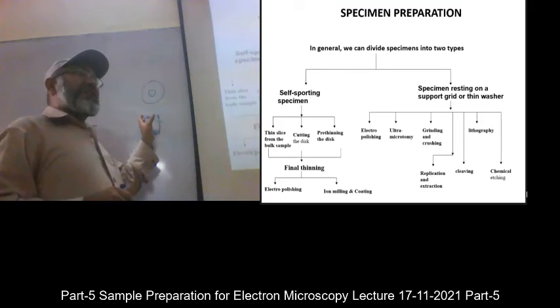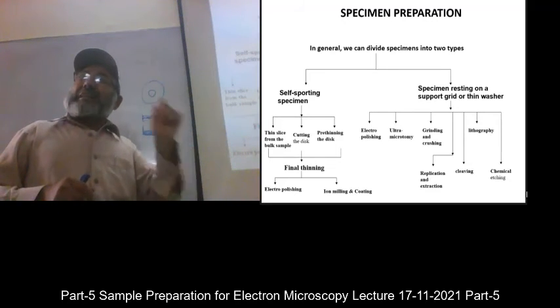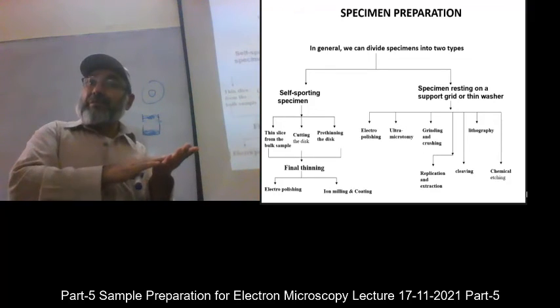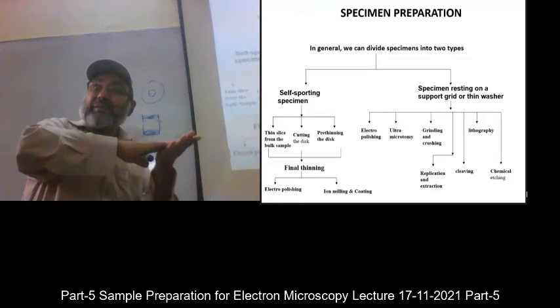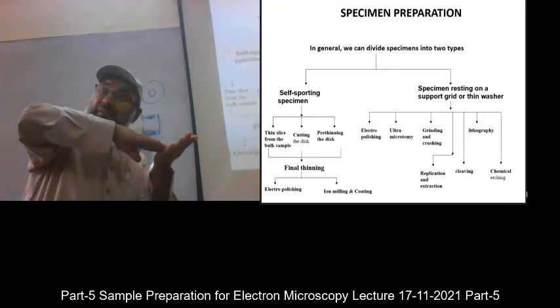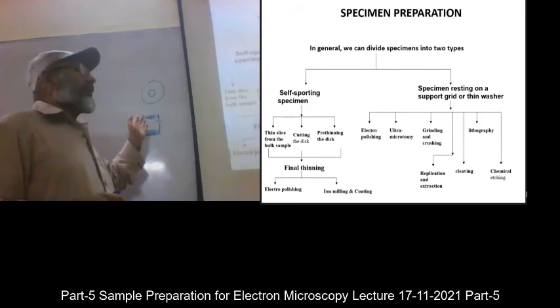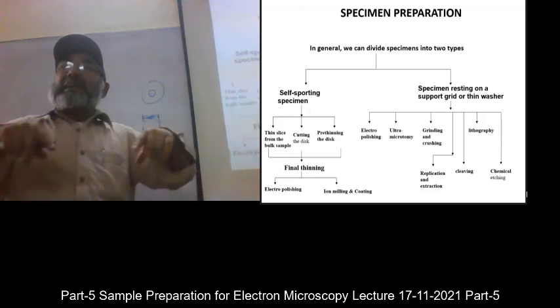So by changing the angle of the beam, you are decreasing the extent of thinning, but you are actually polishing the surface like this and like this. Polishing is this, grinding is this, right? So by decreasing the beam angle, you are polishing the surface, and this polishing increases the thin area.